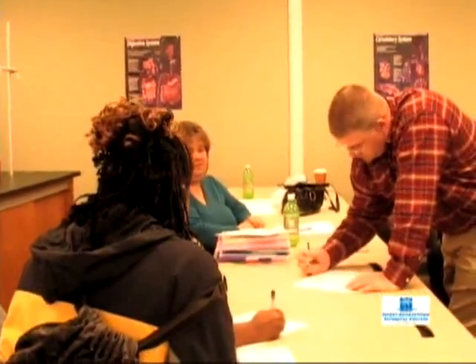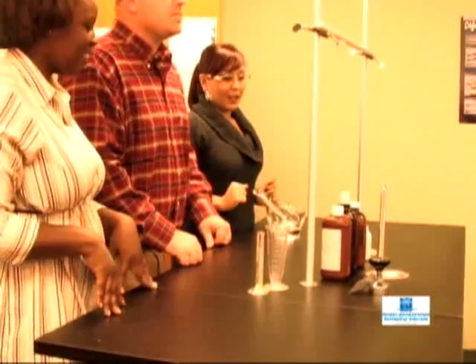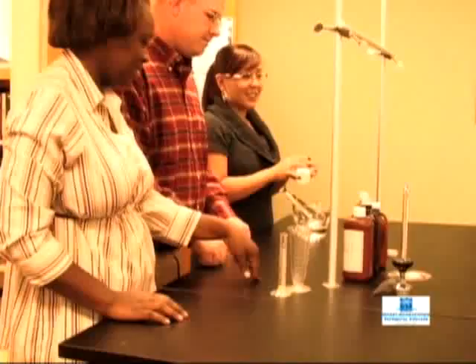After he completes his instructions, some students will be asked to fill the magic mouthwash prescription, while other members of the class will have the opportunity to observe and ask questions.